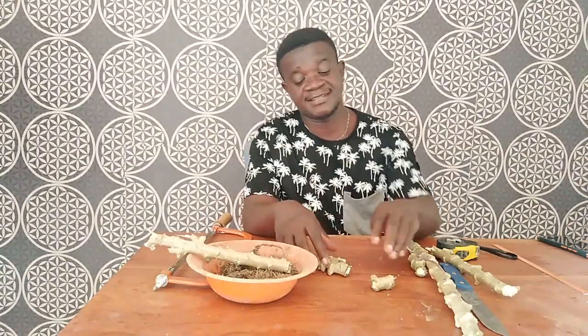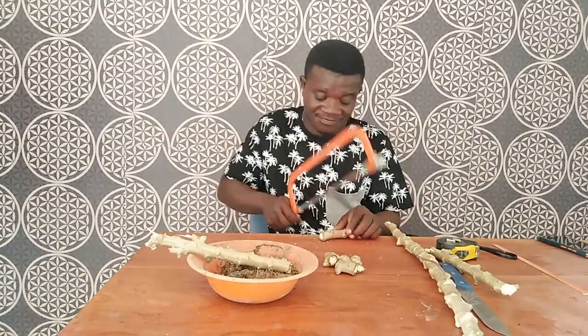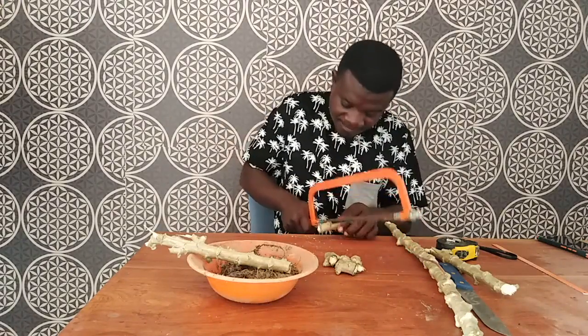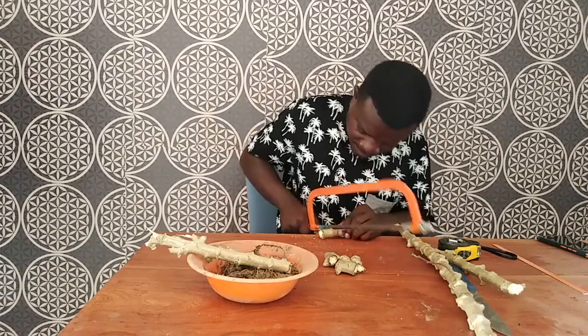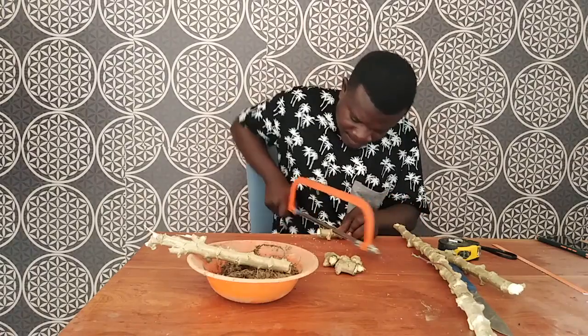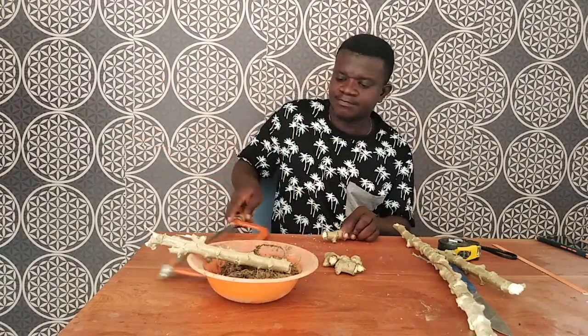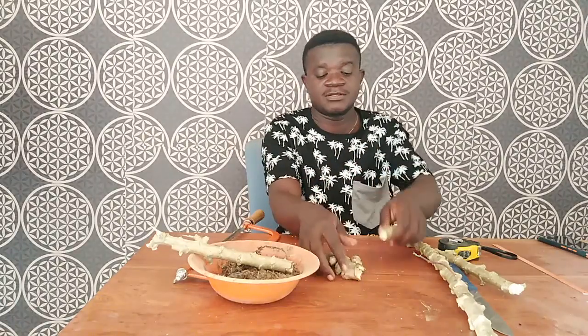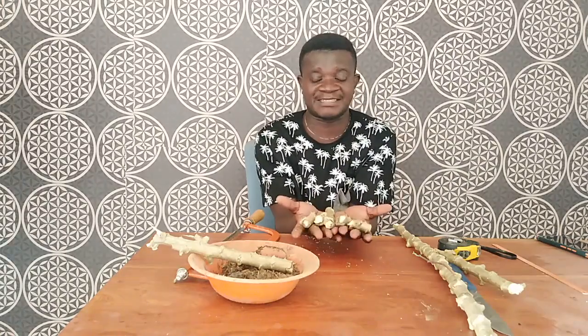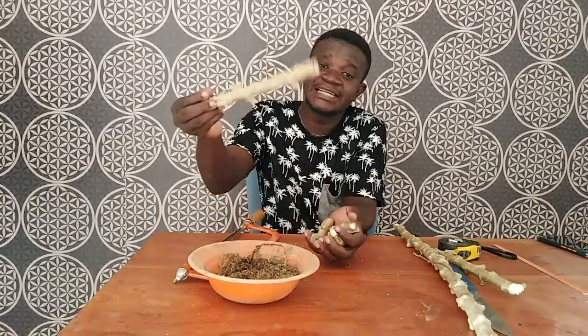You see — look at the number that we got from this. We are getting a lot. We have one, two, three, four, five, six. And out of these six pieces, we can get six cassava plants instead of planting this whole thing and getting only one.